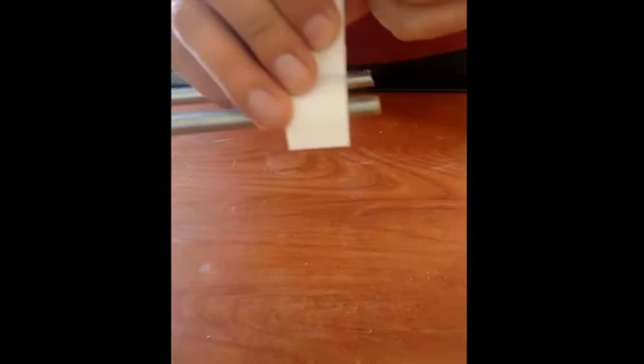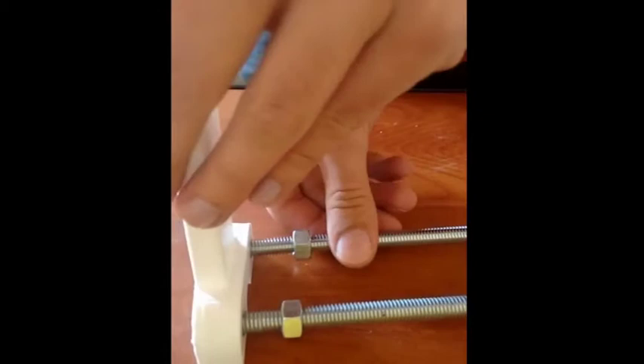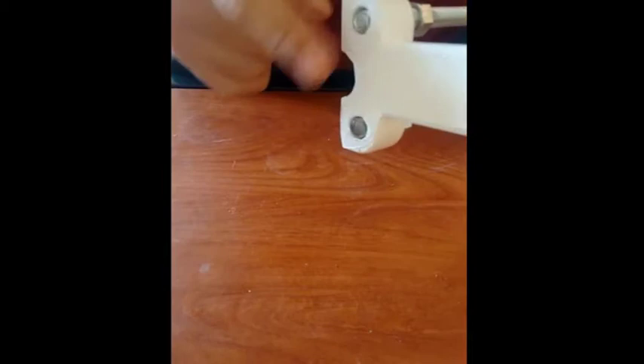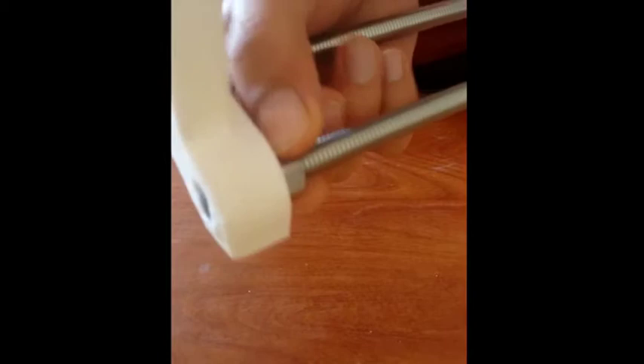The next step is to take the bigger pillar and pass the big screws through it — cut to appropriate size as mentioned in the parts list. Make sure these are passed a little ahead to compensate for the thickness of the smaller pillar, then pass the rods through. Once all the rods pass through, we lock this condition by putting nuts at the extreme ends. Now the smaller and the bigger pillar are constrained with each other and cannot move relatively.